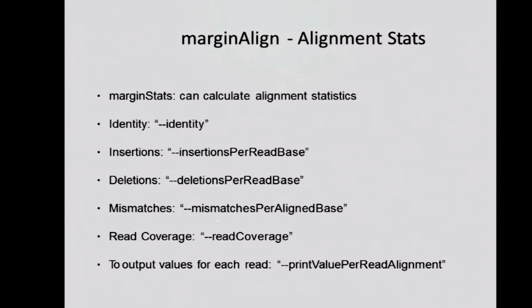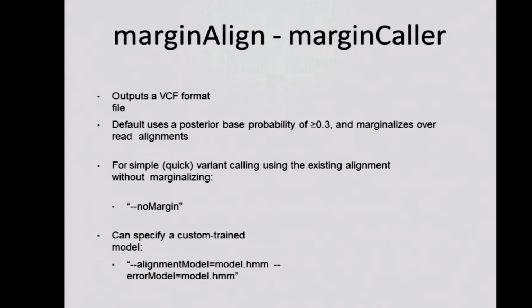Alrighty. You can get the alignment stats: how many deletions per read base, how many insertions, how many mismatches, coverage, these sorts of things that are generated through many different tools, but specifically aimed towards the sort of metrics you're going to see with the MarginAlign tool set.